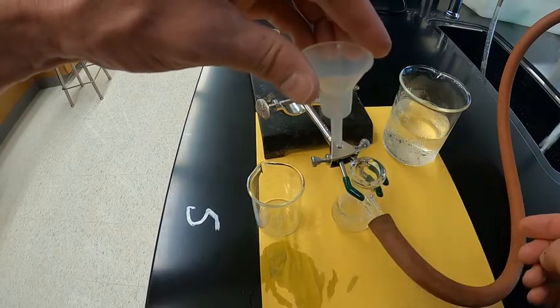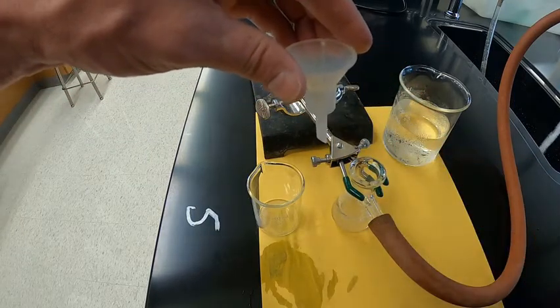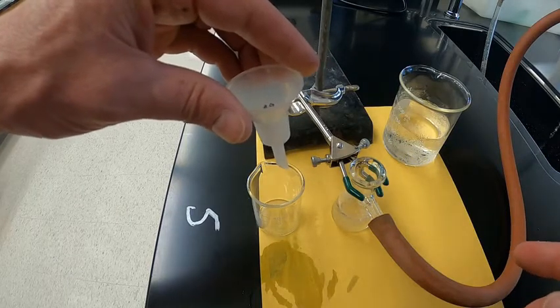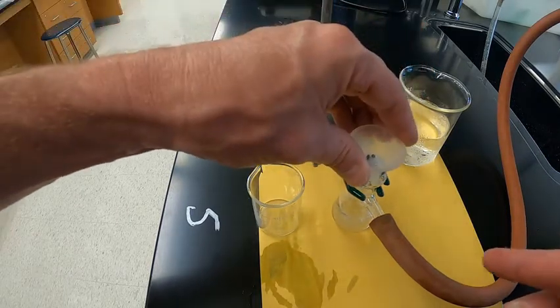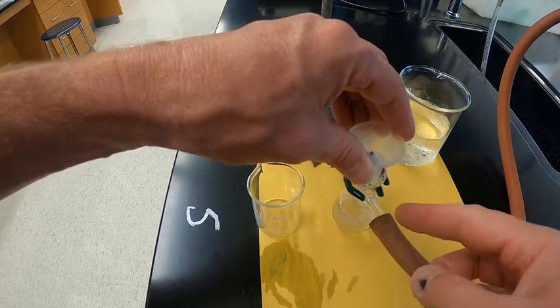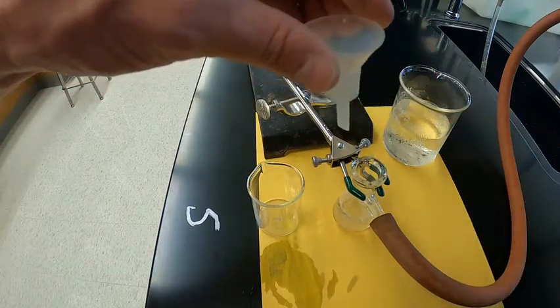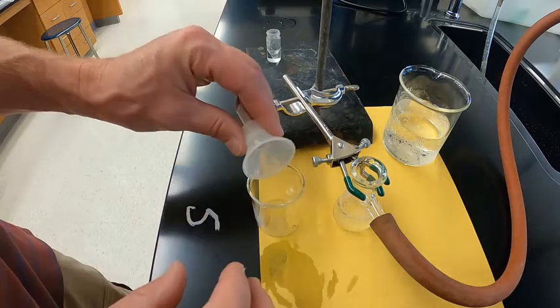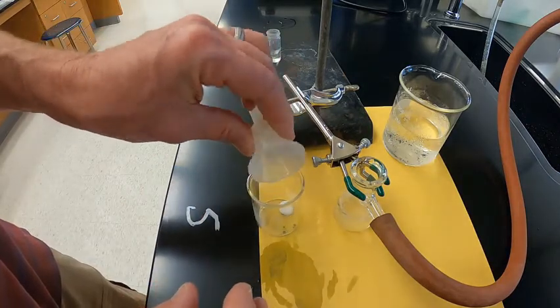Now you can hear the vacuum being drawn, and then turn the water off. So what that does, if you turn off the water with the funnel still on there, the vacuum could cause a big surge of air that splashes water back up into here and then causes your product maybe to get lost.